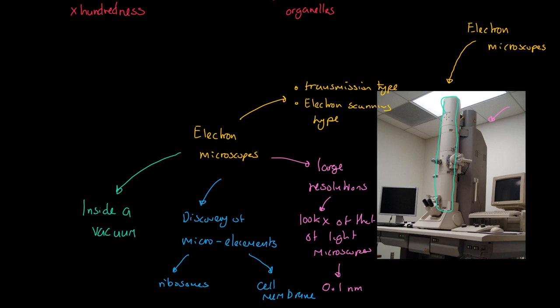It's actually a weakness of these microscopes that they're darn sensitive. So they have to be dealt with in a very, very specific manner. Now, they're still very valuable to use. They provide unbelievable results, but nevertheless, we have to treat them very carefully.